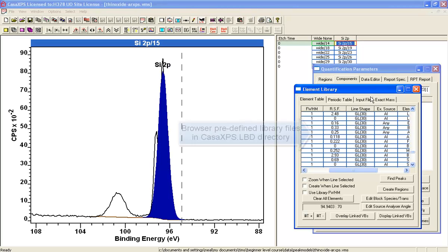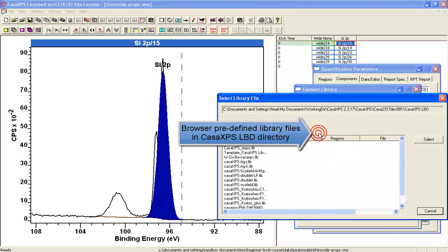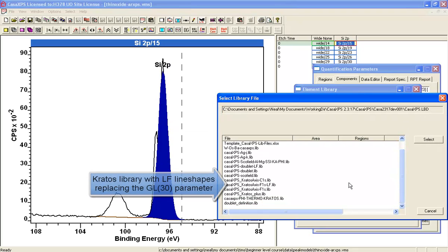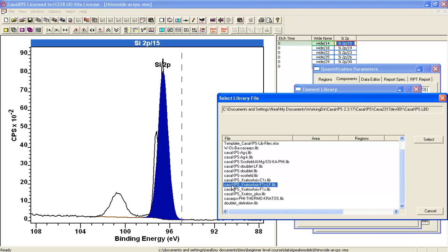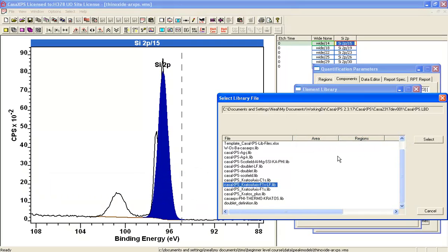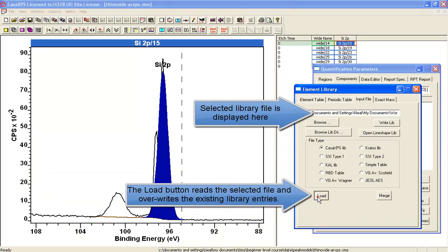So what I'm going to do now is load an alternative element library, and there's a directory CasaXPS.LBD that can be populated with different forms of element libraries depending on the application. In this case, what I'm going to use is the Kratos sensitivity factors relative to the Fluorine 1S, and also it'll have an LF line shape rather than a GL line shape, so I'm going to select that one and load it.